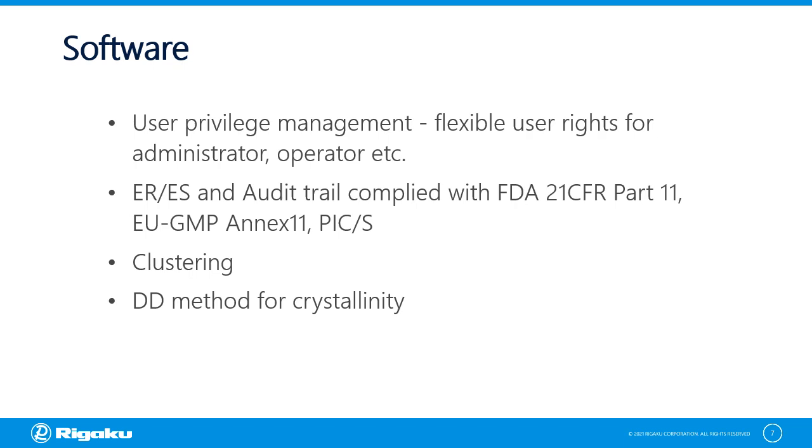The DD stands for direct derivation. This method was developed by us and first published in a paper in 2016. This method enables us to quantify crystalline and amorphous materials without the structure information. We will demonstrate some of the features during the XRD workshop later today.